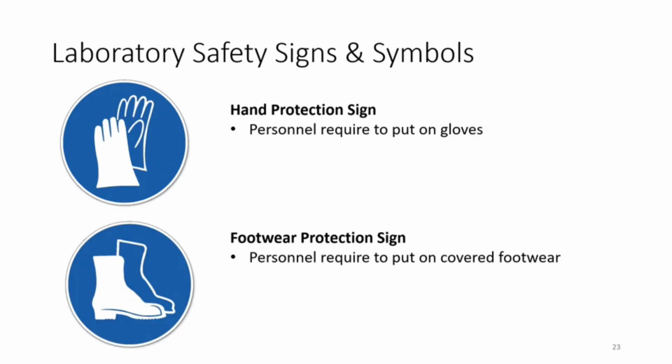Hand protection sign, personnel required to put on gloves. Footwear protection sign, personnel required to put on covered footwear. Again, these two signs are not so commonly seen in our lab because by default, you should be wearing gloves and also covered shoes when working in the lab.